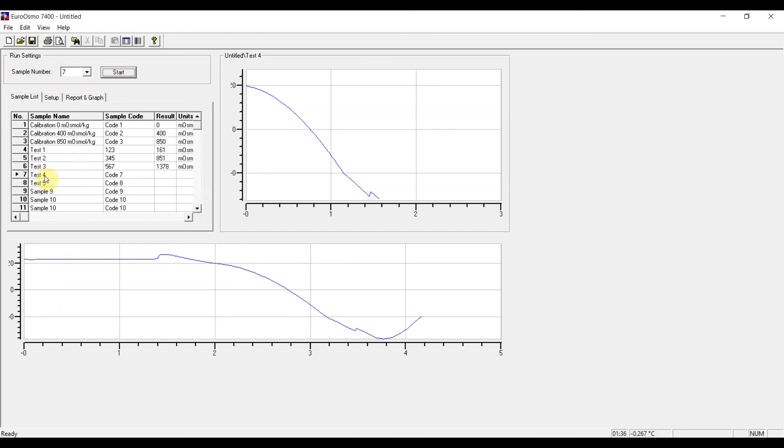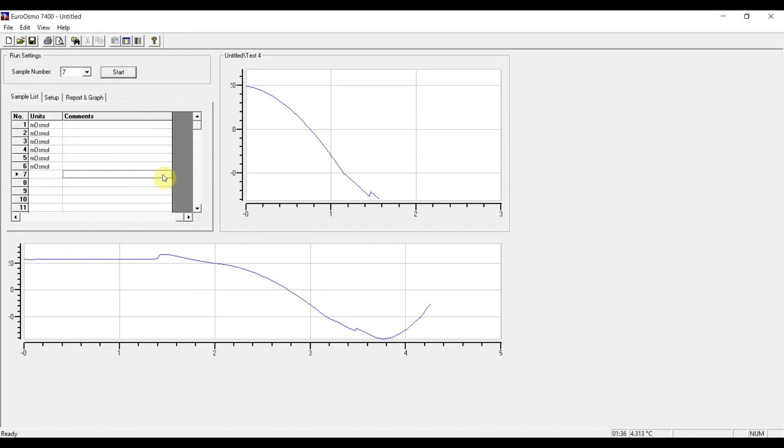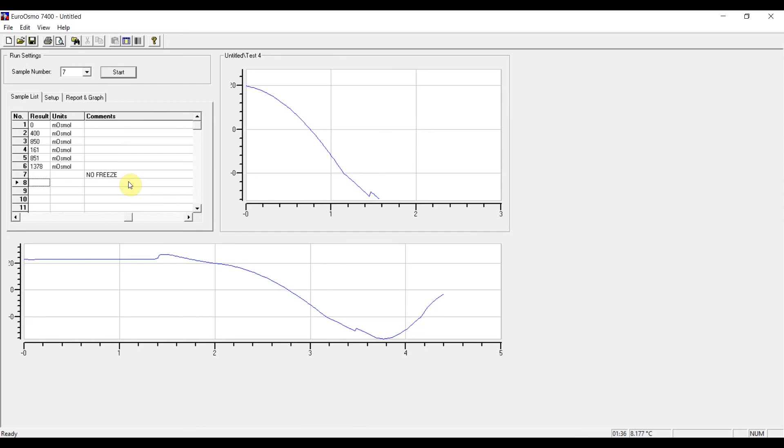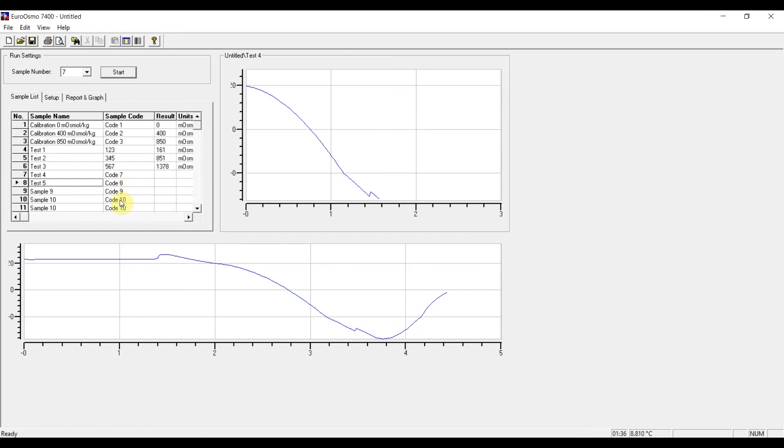there would be no documentation of the no freeze error. If you wish to document the no freeze error, you can, for example, enter it here and then continue to measure test sample four again.